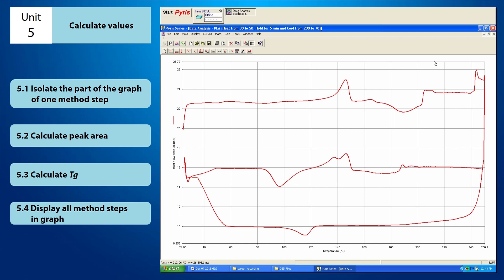Your graph may consist of one method step or more than one method steps. If your graph consists of more than one method steps to be calculated, you can isolate the part of the graph of one method step.